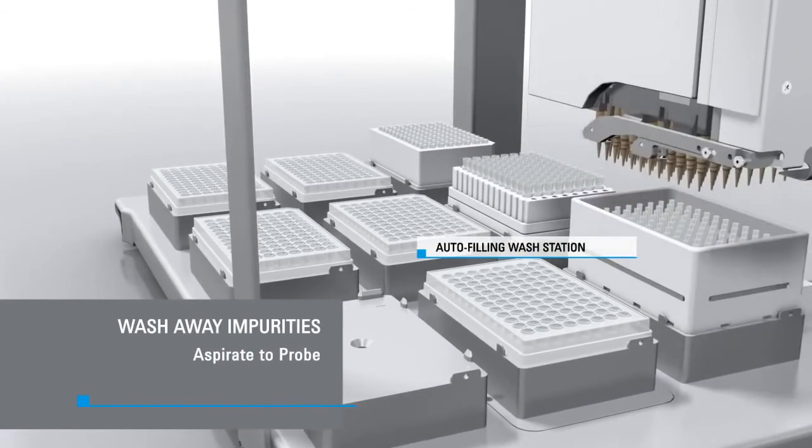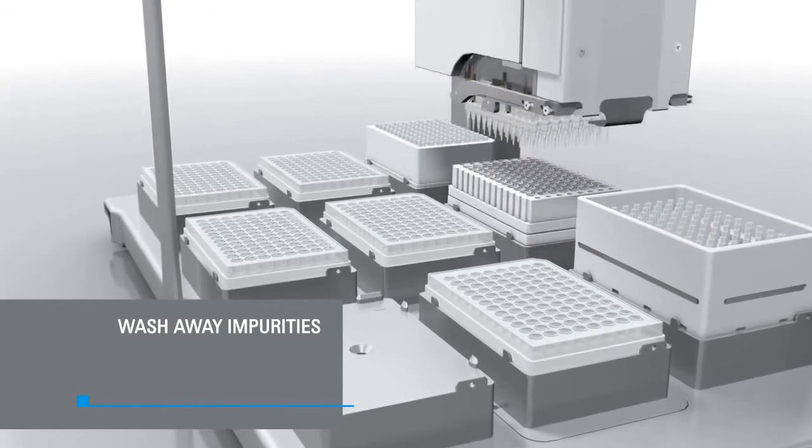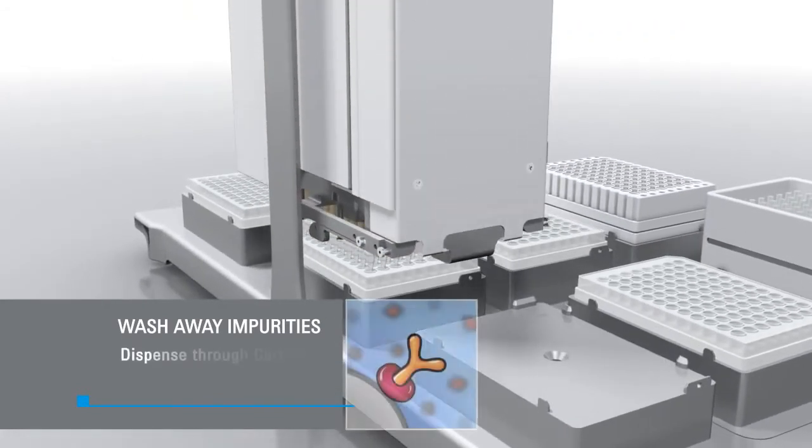Impurities are then washed away by dispensing buffer through the cartridges into the reserved waste plate to give isolated antibody bound to protein A.